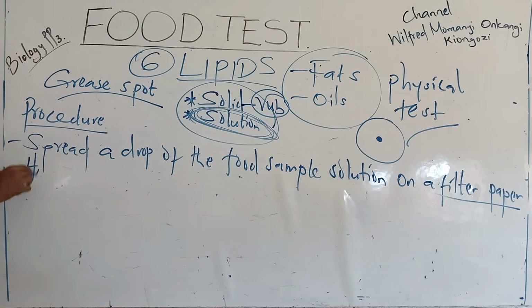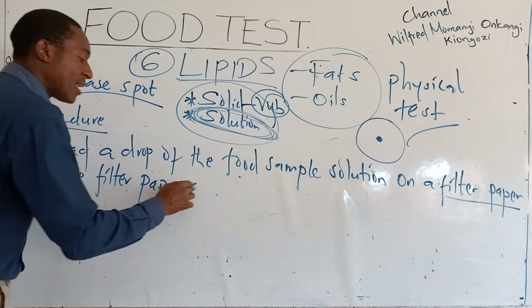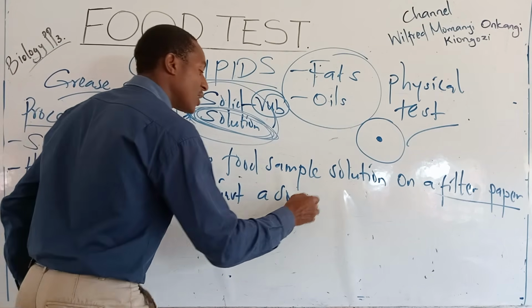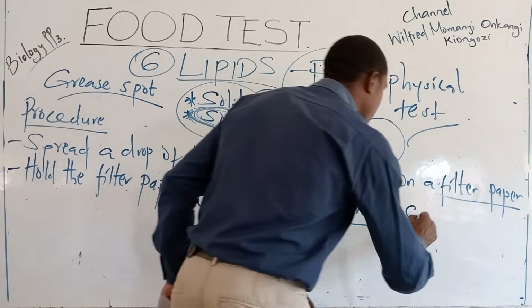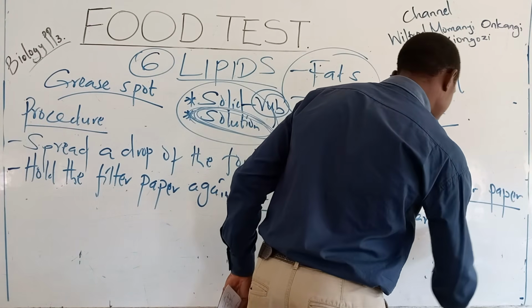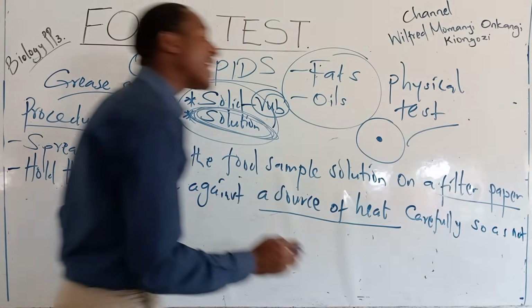Hold the filter paper against a source of heat. But you must be careful so as not to burn the paper.